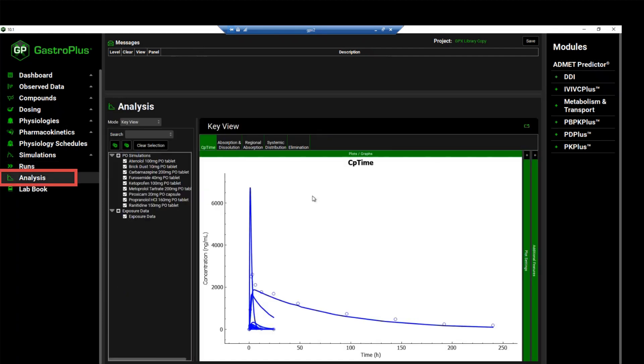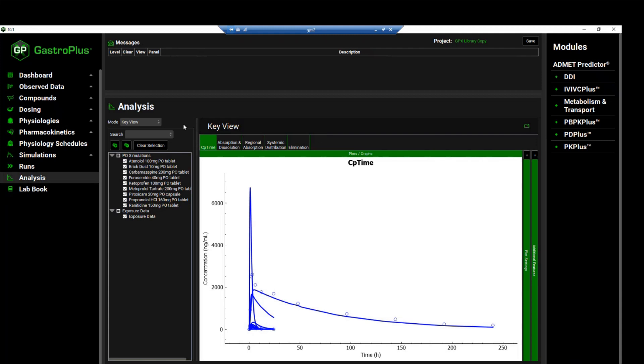The analysis view will automatically be activated when the run has completed. In this case, we don't want to assess the key view mode.